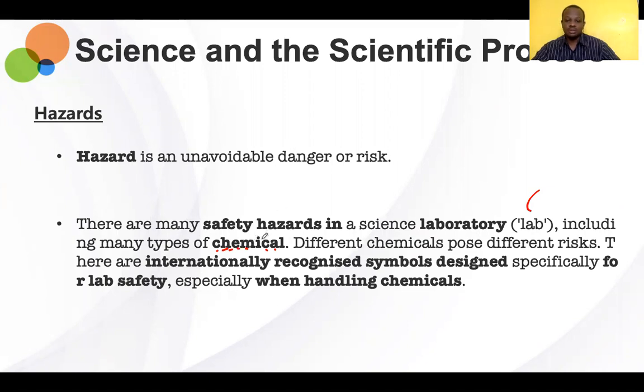So these can cause risk. There are internationally recognized symbols across the entire world. These symbols are specifically for lab safety.